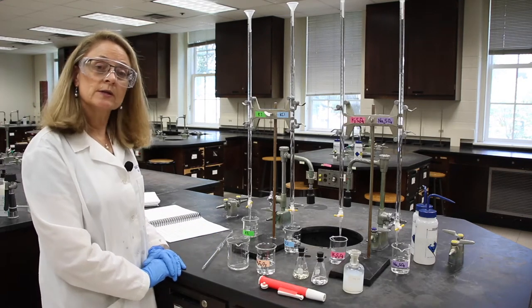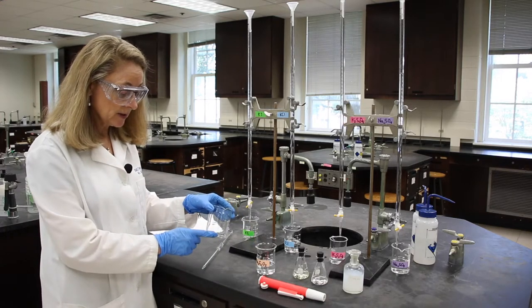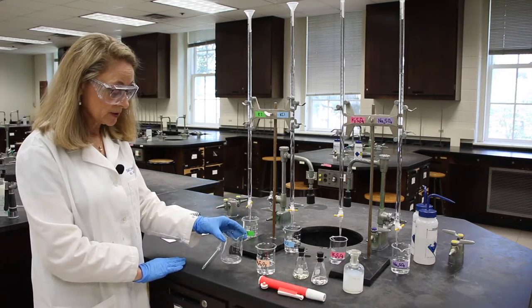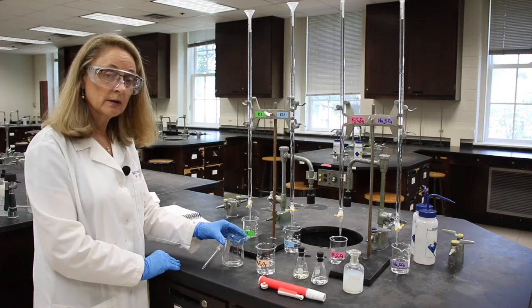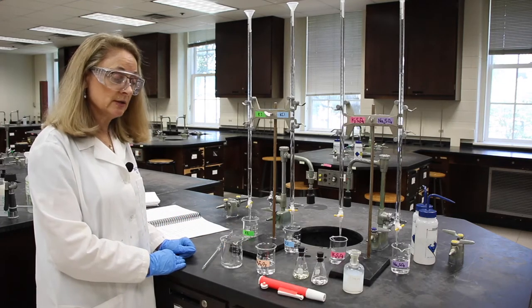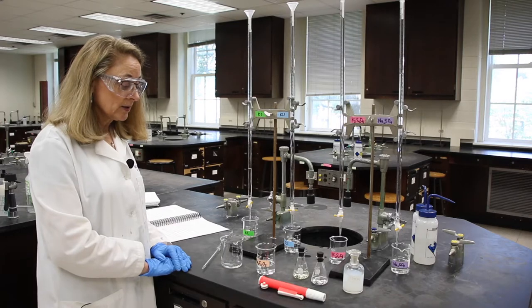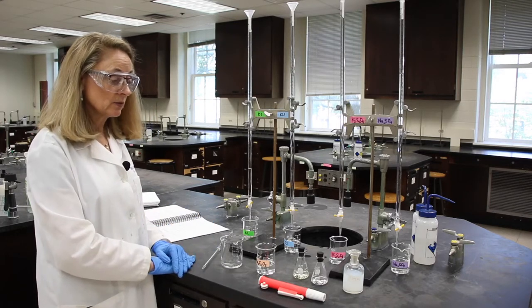What we're going to do is measure the time of reaction, and we'll be able to see that because in this beaker we'll get a solution that ranges from a brownish blue to a dark blue, from clear to a colored solution, and we're going to be measuring the time. From that we can get a rate, and from the concentrations, we've given all the data that you need to develop the concentrations, we can calculate the rate law and the orders with respect to the reactants.